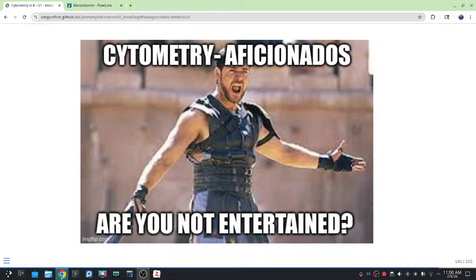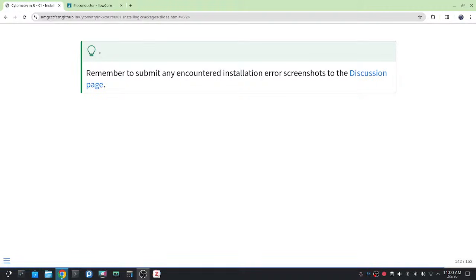So what you're feeling is normal, and you don't have to know how to do this by the end of today. It's something we'll be repeating throughout the course. Anytime we introduce a new package, or anytime we are actually using a package, I will give those same kind of reminders we did today as far as the installation commands, the reason why we're using those installation commands, as well as the use of the library to attach things.